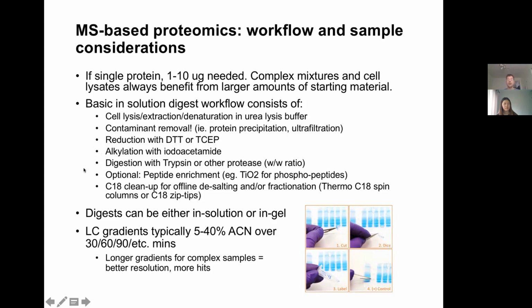And then after you have all of these digested peptides, the world is kind of your oyster, and you can enrich for certain kinds of peptides. So titanium dioxide or iron NTA are really common to enrich for phosphorylated peptides. And then, yeah, just sort of a procedural thing, but it's nice to desalt your peptides before running them.